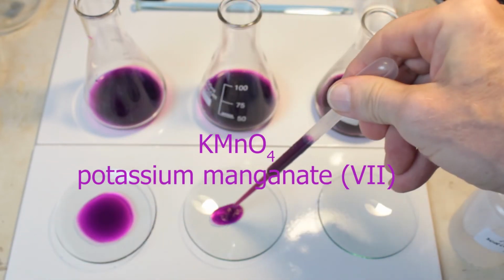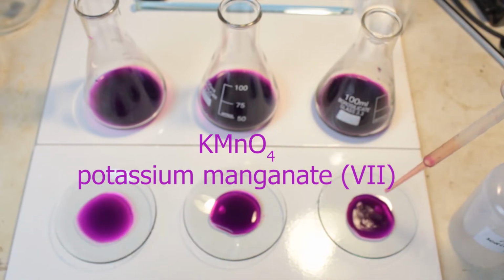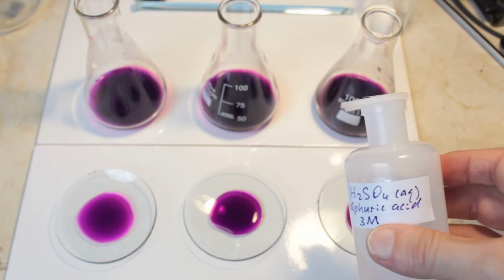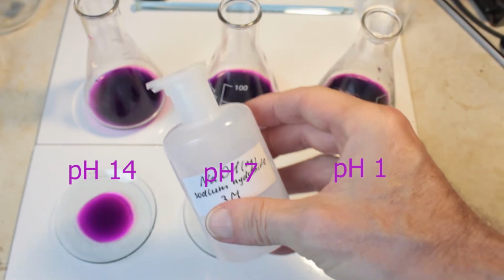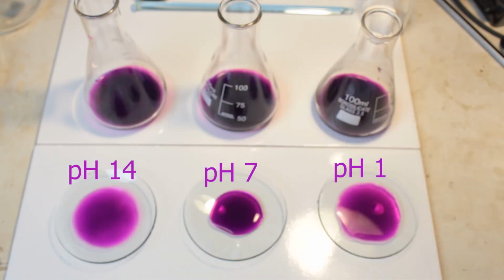I put it in the watch glass because the color change is a bit better to see there. So now, the amount of reduction would depend on pH. Normally we do reduction in acidic conditions, and I'm going to create these acidic conditions on the right. So I'm putting sulfuric acid on the watch glass in the right. I would leave the watch glass in the middle as it is with pH 7, and I would make alkaline conditions on the left with sodium hydroxide. So, okay, sodium hydroxide, we have different pHs, a lot of hydrogen ions here, some moderate amount in the middle, and virtually nothing on the left.